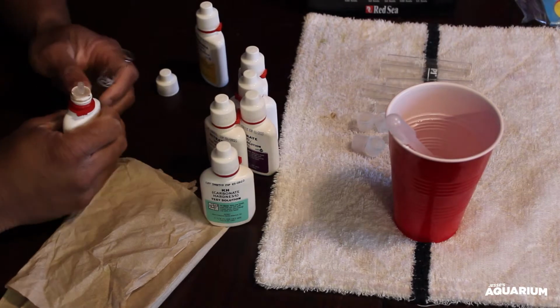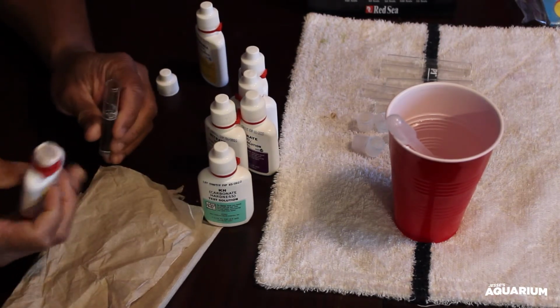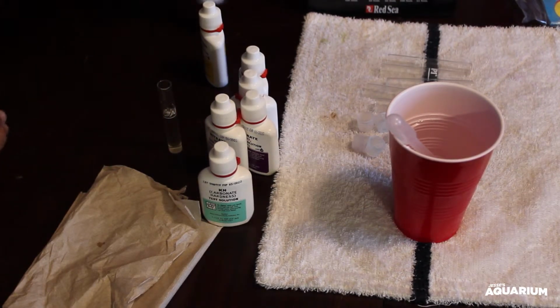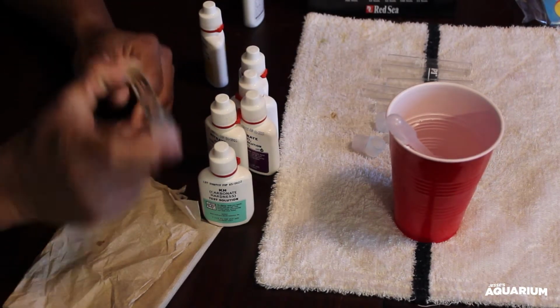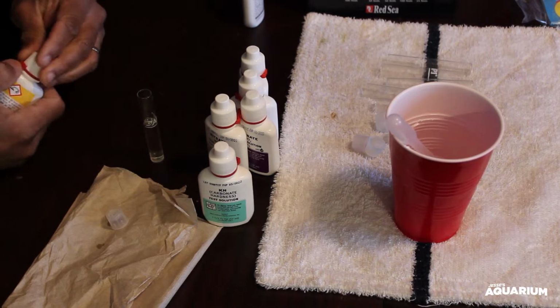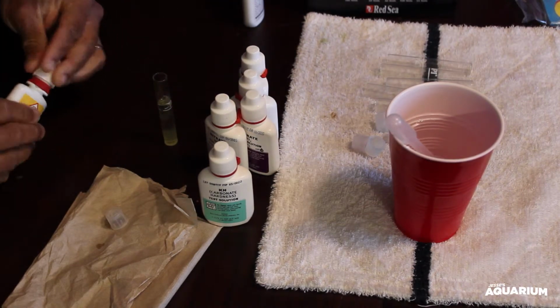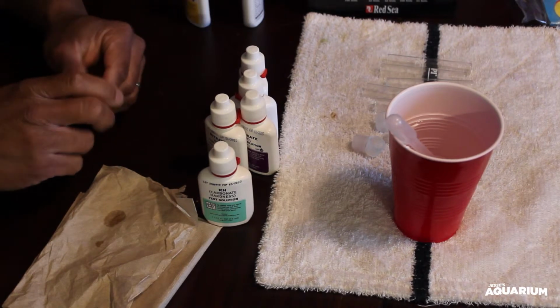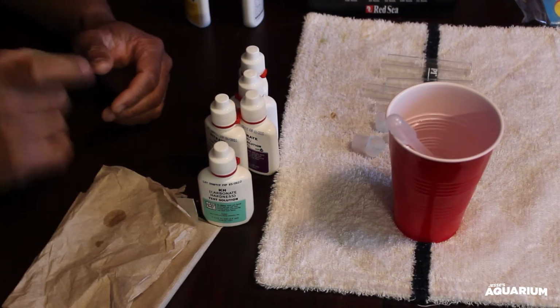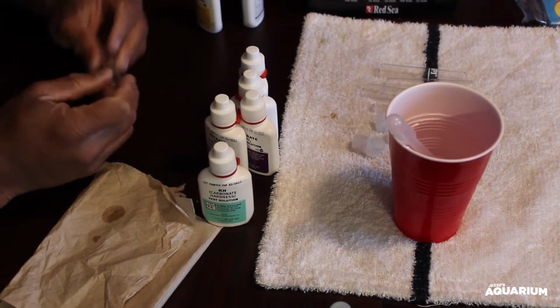And of course, most of us who've ever used API test kits know it tells you right on the bottles how many drops for each one. Ammonia says 8, so we'll start with 8. Alright. Give that a little shake. Now we'll add the second solution. Give this a good shake. We'll set that aside and wait 5 minutes to find out what the readings are for the ammonia in the tank.